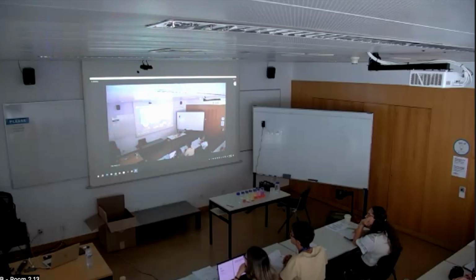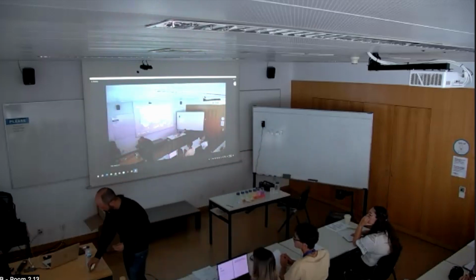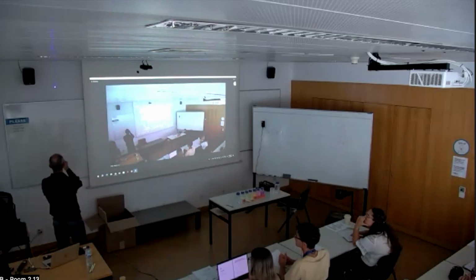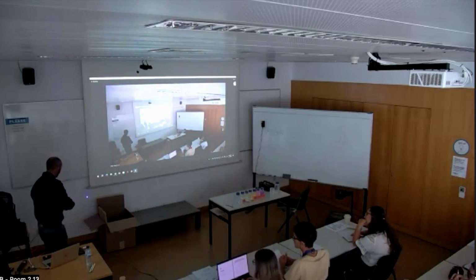It's really possible to see, but if I go really close, you will see, and if you come very close to the wall, you will see. But basically, there is a difference in size of the diffraction pattern, and this is really obvious with a very short wavelength. Do you see how tiny the diffraction pattern is here? It's so tiny that whoever is far away doesn't see it at all. Do you see it? Barely.